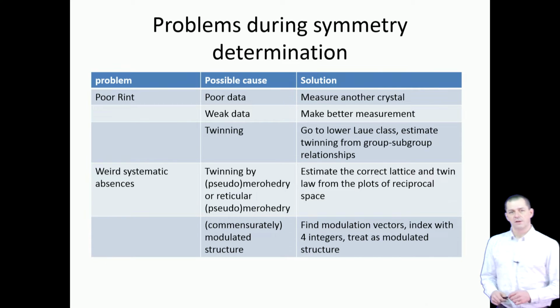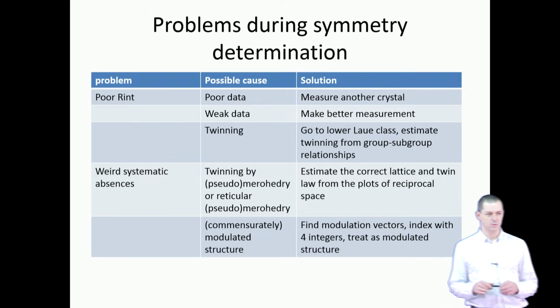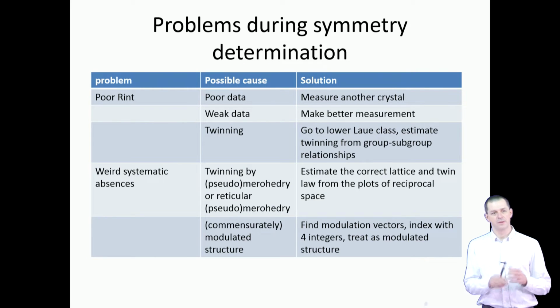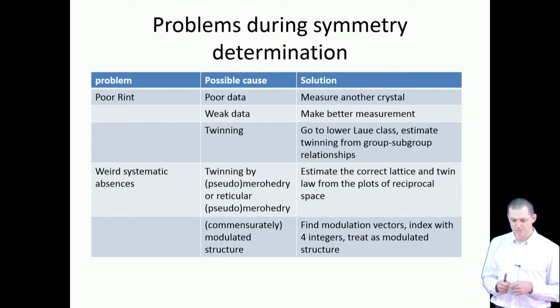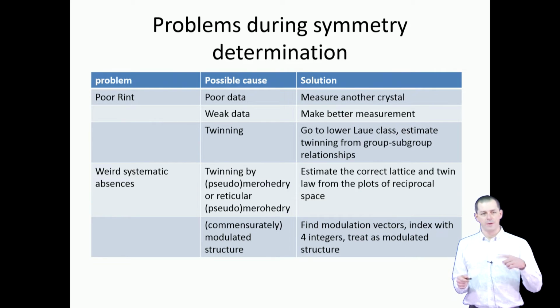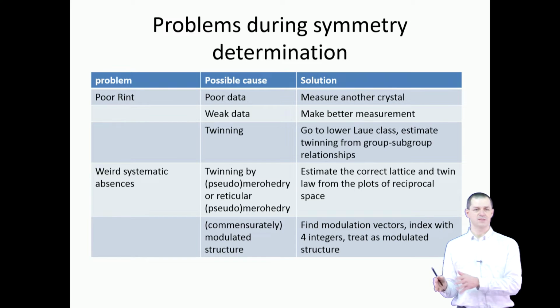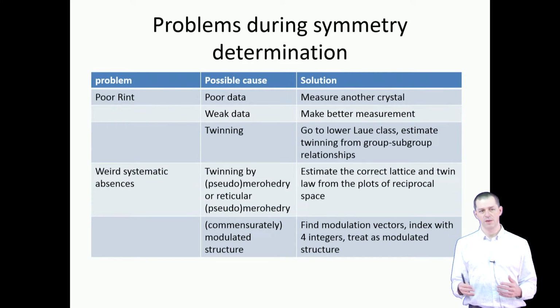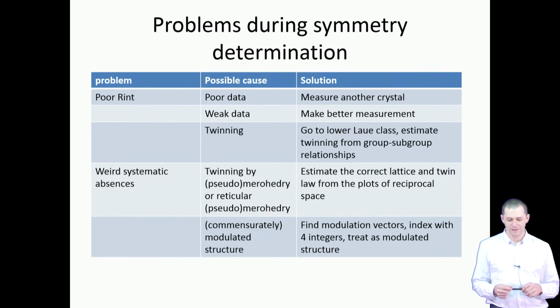So that was the data processing stage, let's say. So now we assume that the data processing stage went well and we didn't find any signs of anything suspicious. I repeat what I said at the beginning. The best way to solve problems is to avoid them. So before you come to the next stage, you should be as sure as possible that there was no problem that you missed in the previous stage. Like that, you save quite a lot of problems in later stages.